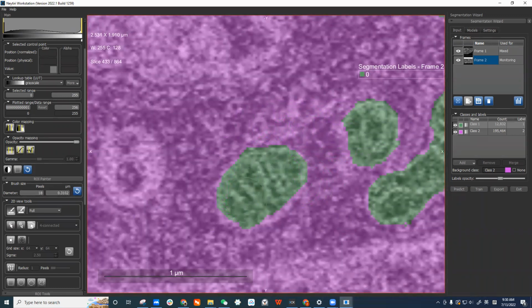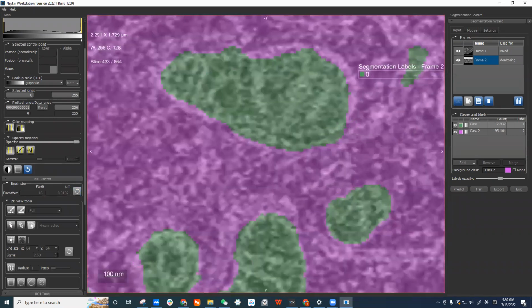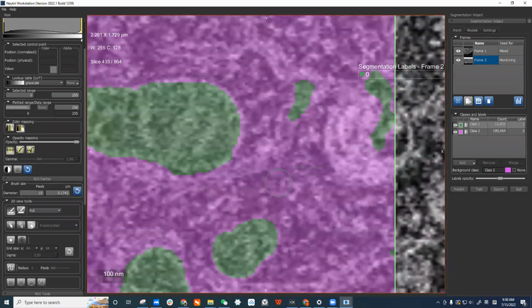And after that, I will stop the demo for today. So let's try one more time. We could train a multi-class model. Now we have this one. I have only 2 classes, but it's okay. If we want to segment multiple classes, we can train a multi-class model.